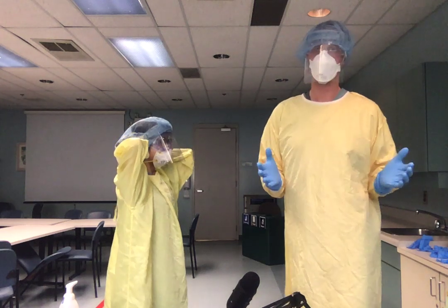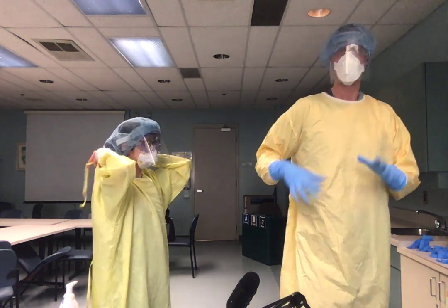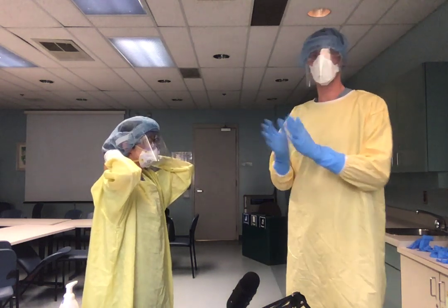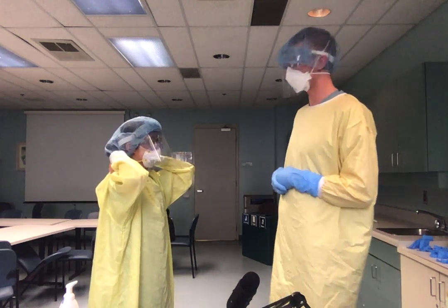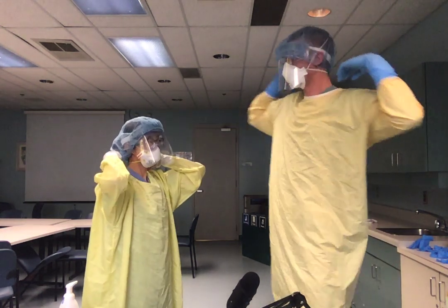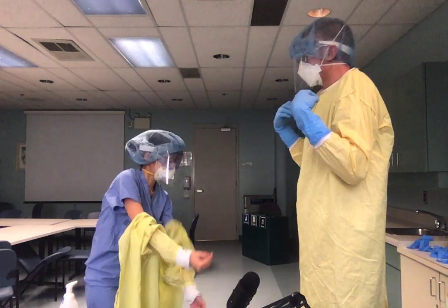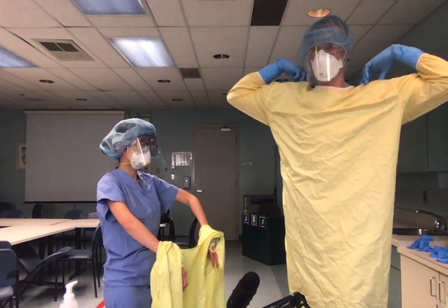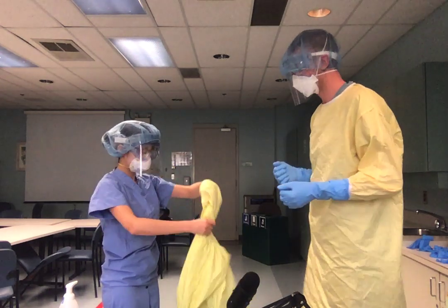Now there are different gowns at other institutions. At St. Mike's you have a disposable gown, I understand. And your first step is sometimes to take it off at the waist and then do the gloves, wash your hands, and get the neck. We're showing the St. Joe's way because we don't have your guys' gowns. So you see Nancy's untied. Nancy, I want you just to roll that gown down from the shoulders. And you see, guys, she's not grabbing it from the front. It's an economy of movement. She's untied here, so she's just letting that gown strip down, and you can get rid of that gown there, Nancy.